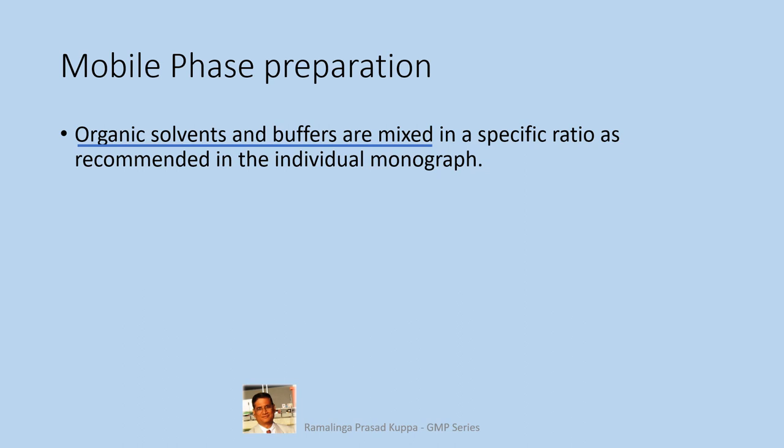But if you interpret as 90% buffer in 10% acetonitrile, the solvent should be diluted to 10 times with the buffer. In both the cases, the retention times of peaks may vary. To make it simple to understand, 1% solution means 1 gram is dissolved in sufficient solvent and made up to 100 ml exactly. Whereas when 1 gram is weighed and 100 ml is added over it, it will have different concentration. The total volume will not be 100 ml and the concentration is not exactly 1%.